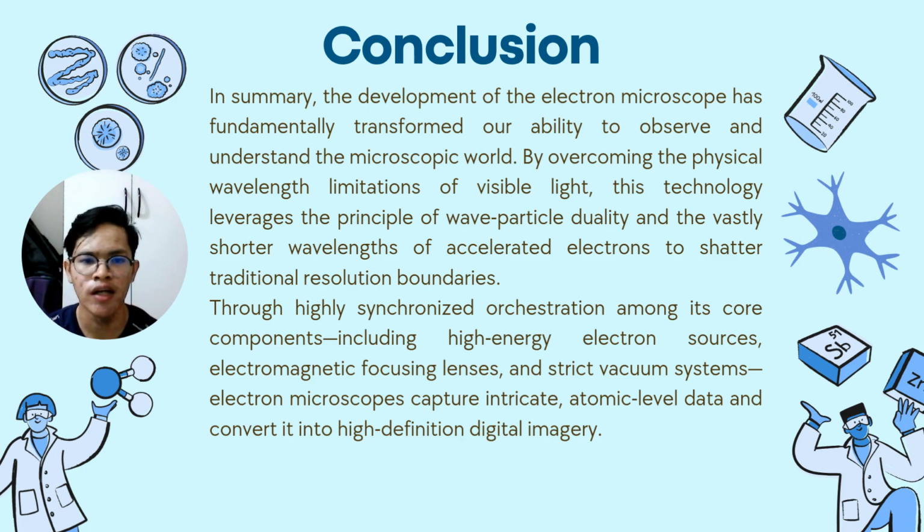Through highly synchronized orchestration among its core components, including high-energy electron sources, electromagnetic focusing lenses, and strict vacuum systems, electron microscopes capture intricate atomic-level data and convert it into high-definition digital imagery. That's all from us.